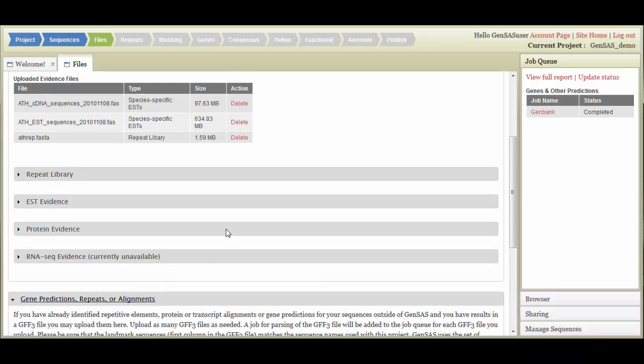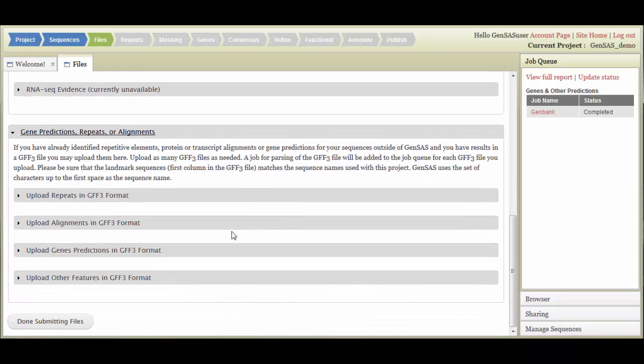Under the Gene Predictions, Repeats, or Alignments section, you can upload GFF3 files from previous annotations or that were output from other annotation tools. The data added here will be available for use with Evidence Modeler under the Consensus step and visible in JBrowse for use with WebApollo. Please make sure that the name of your sequence matches the identifier in the first column of the uploaded GFF3 files.